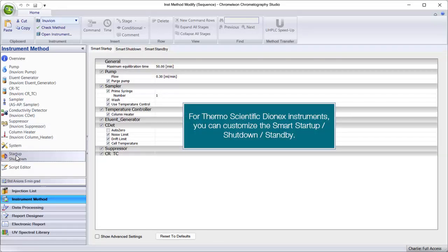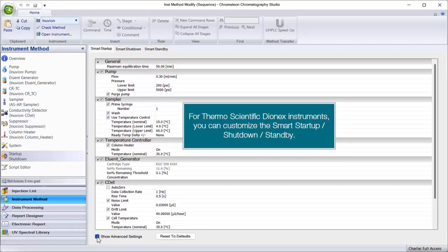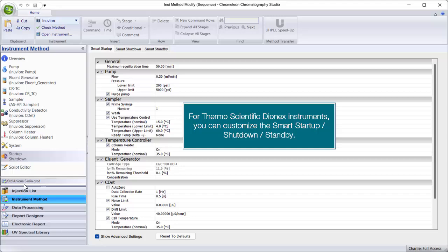For Thermo Scientific Dionics Instruments, you can customize the smart startup, shutdown, and standby.